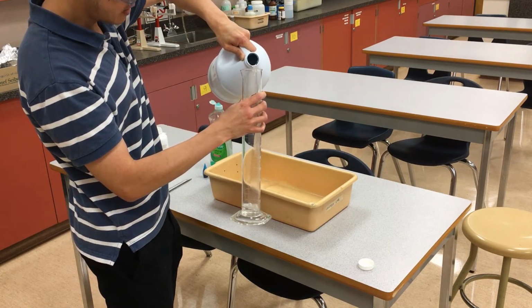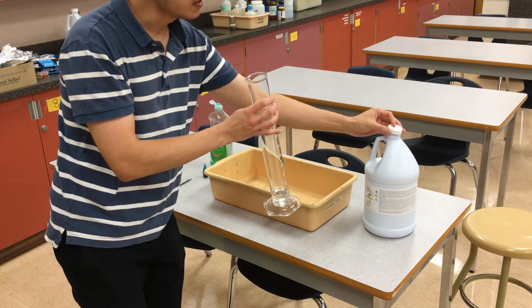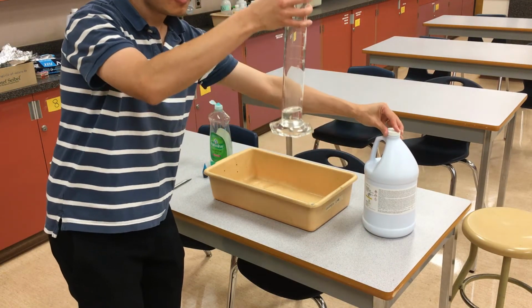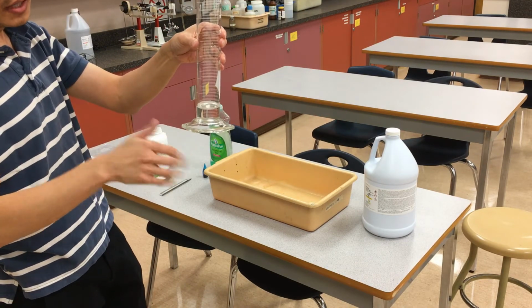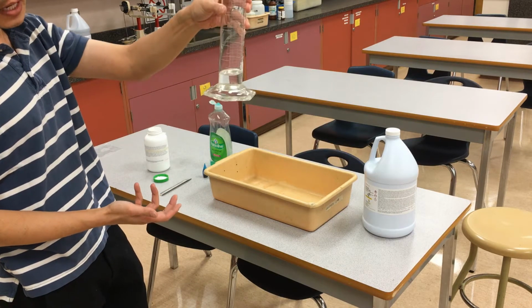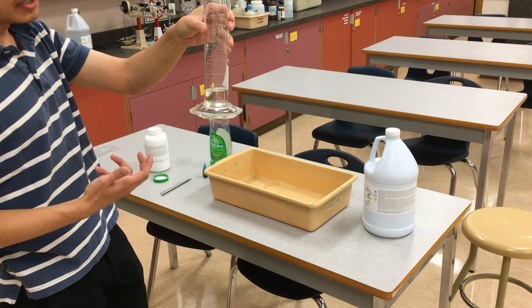This hydrogen peroxide is 30%, so it is fairly concentrated. I'm just going to seal this off when I'm not using it. For this demo, the reaction itself is actually already occurring. The hydrogen peroxide, we get an arrow, see if you can predict what the products are, but as you can tell, not super interesting, right? It's going too slowly to actually be appreciable.